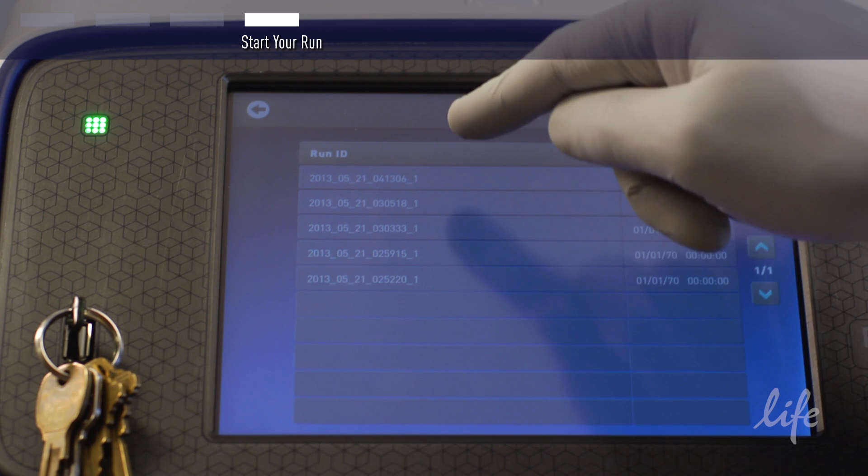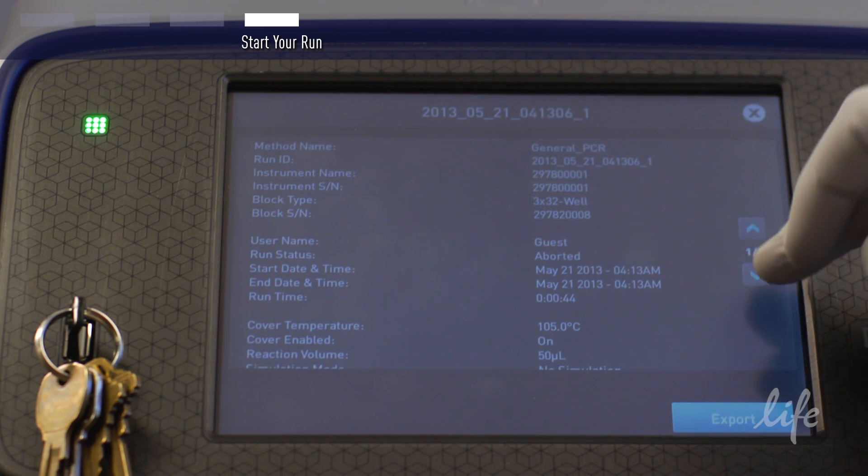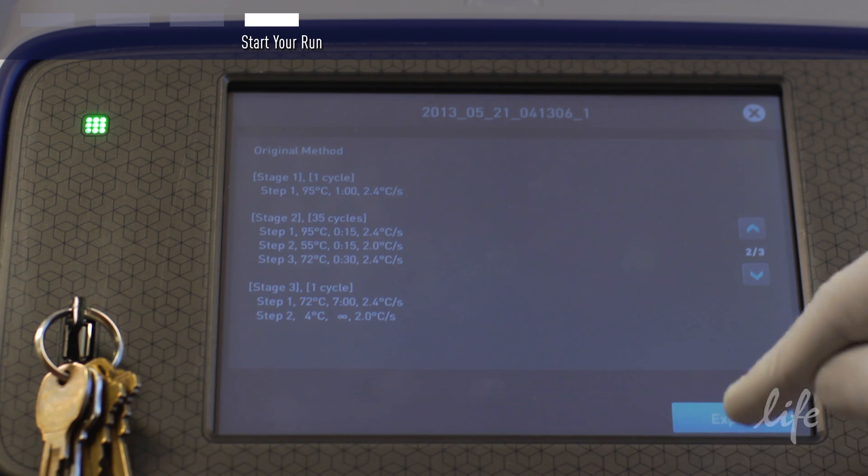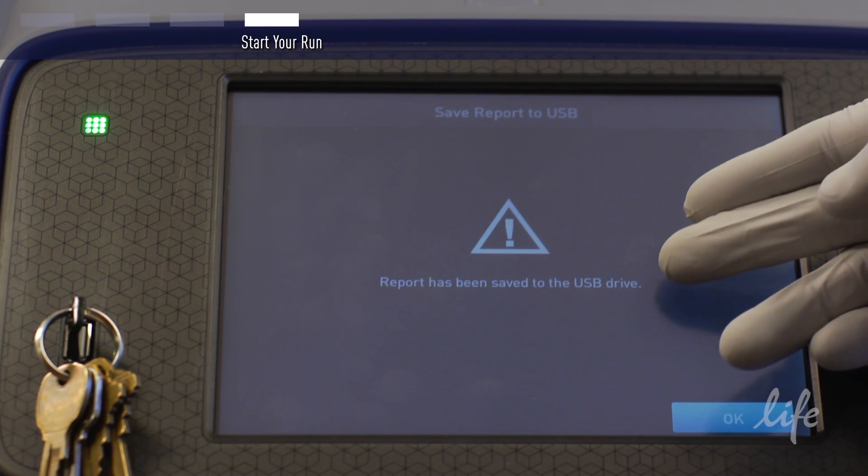You can also export your method files and/or run files to a USB stick and retrieve them for printing or transferring to another ProFlex instrument.